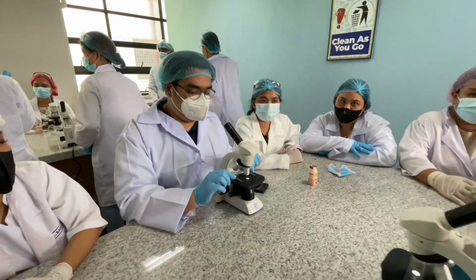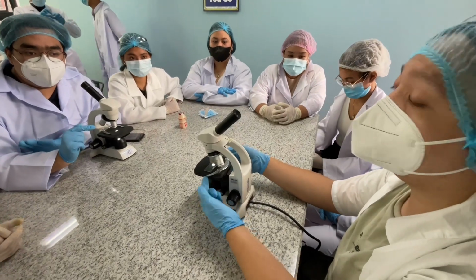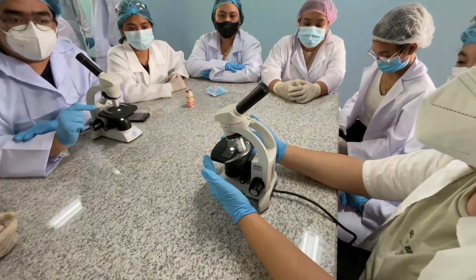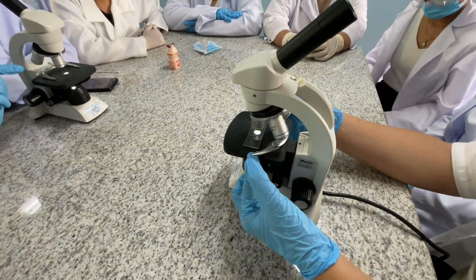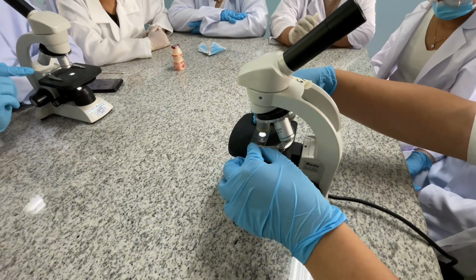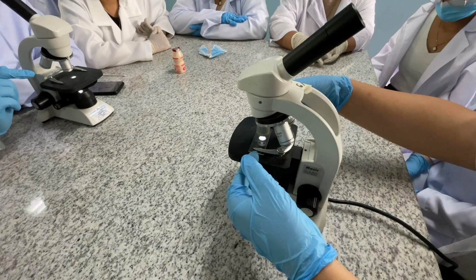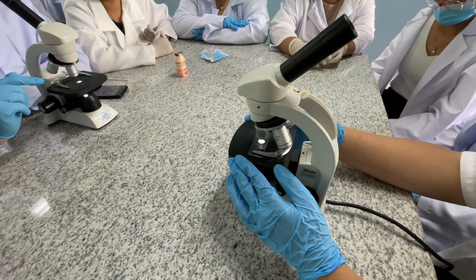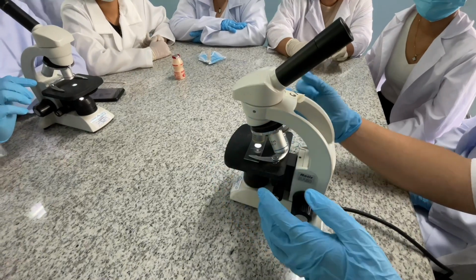Okay. As you can see, naipaliwanag ni Isaac kung paano ginagamit yung stage, and we're going to demonstrate. So here we are, we have the stage, we have the specimen, and all we have to do is to lift this clip. Make sure to properly insert this to our specimen to hold this in place. Ayan. So ganyan guys. Hindi mo siya patutunugin. So avoid doing that because it might damage our glass and glass specimen as well, diba?